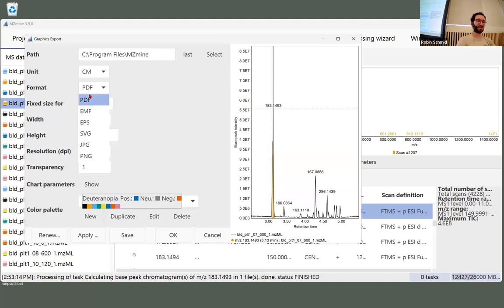This blue is not the same blue as the other one, so I'm going to change everything at once in one thing. And so PDF is definitely very good. And then, of course, for charts that are full of objects, sometimes it's also nice to just say, okay, PNG, and then there's a pixel graphic. You can easily skim through and look at that.